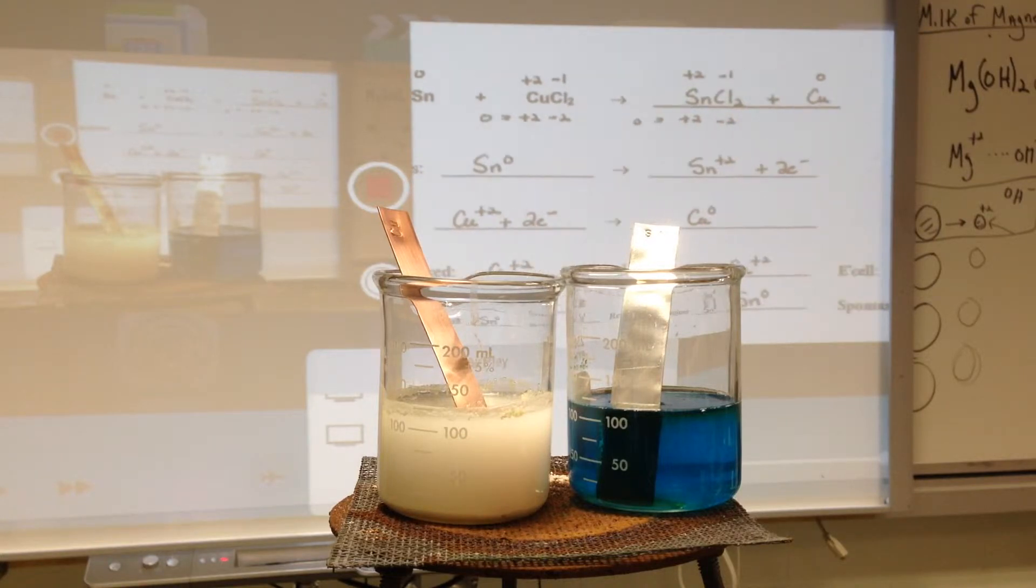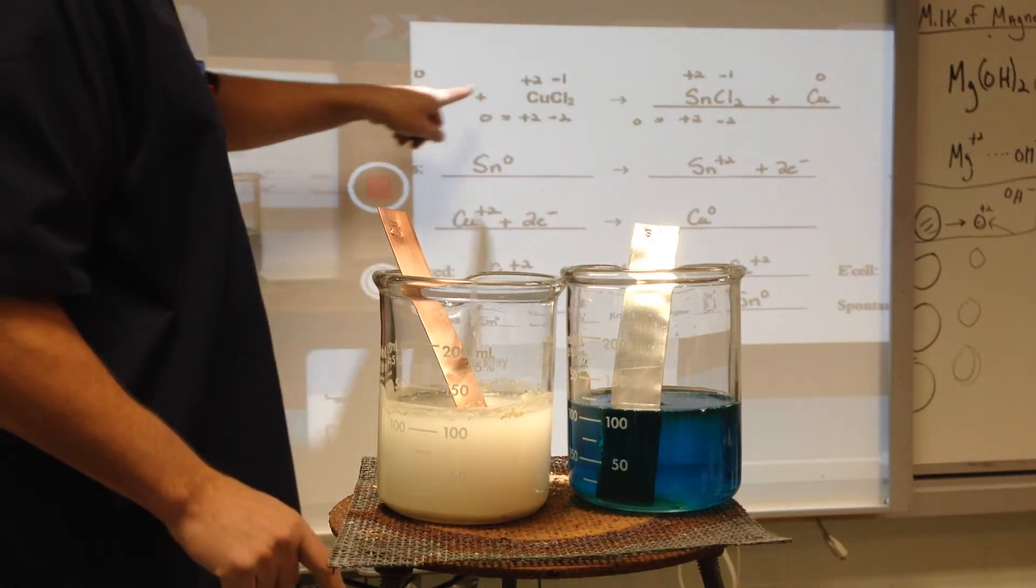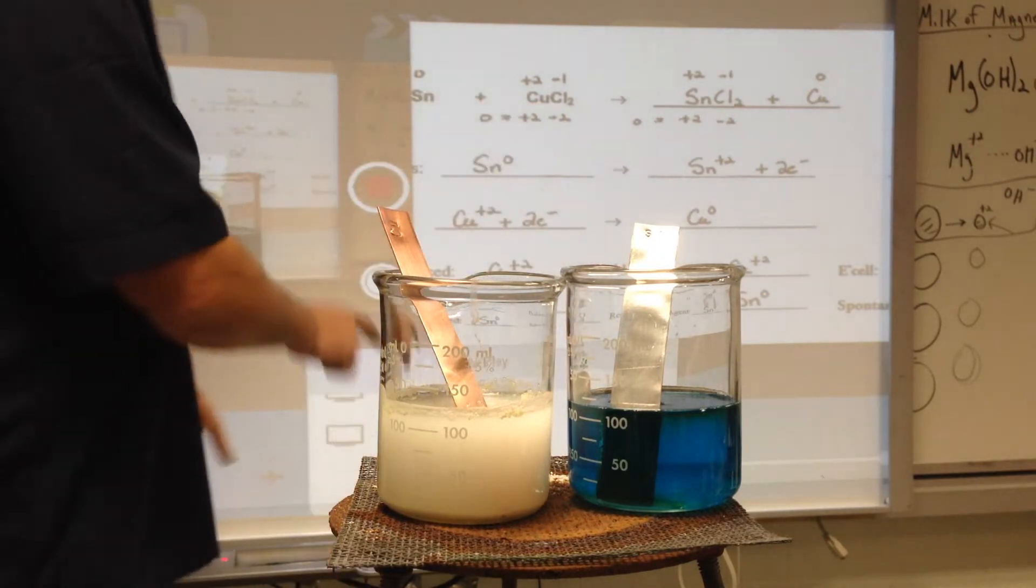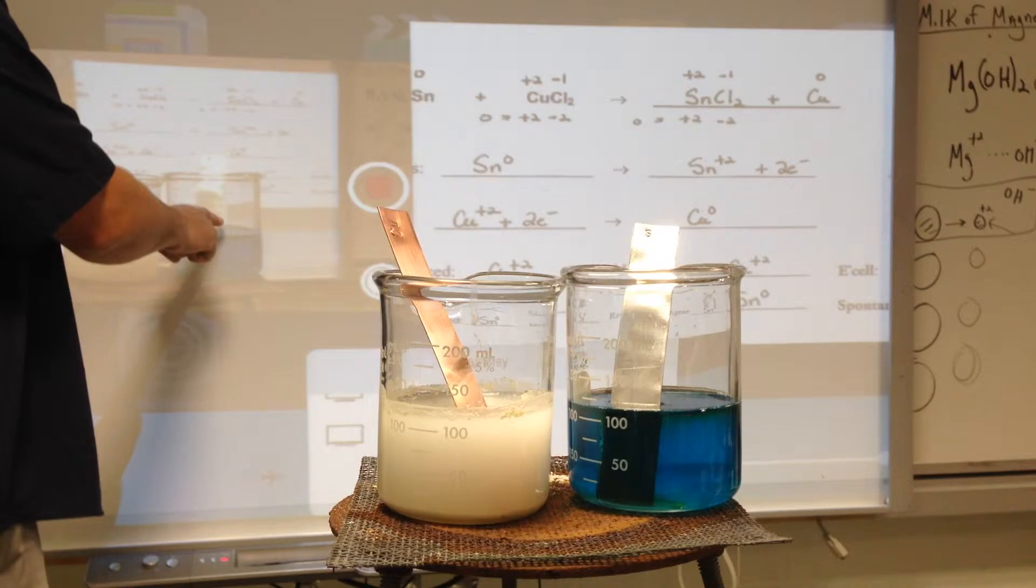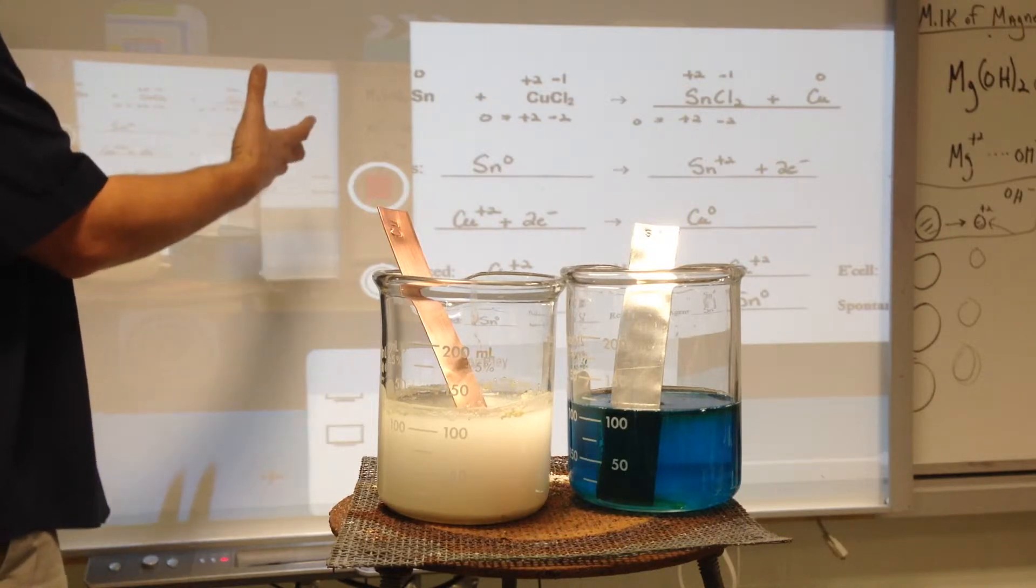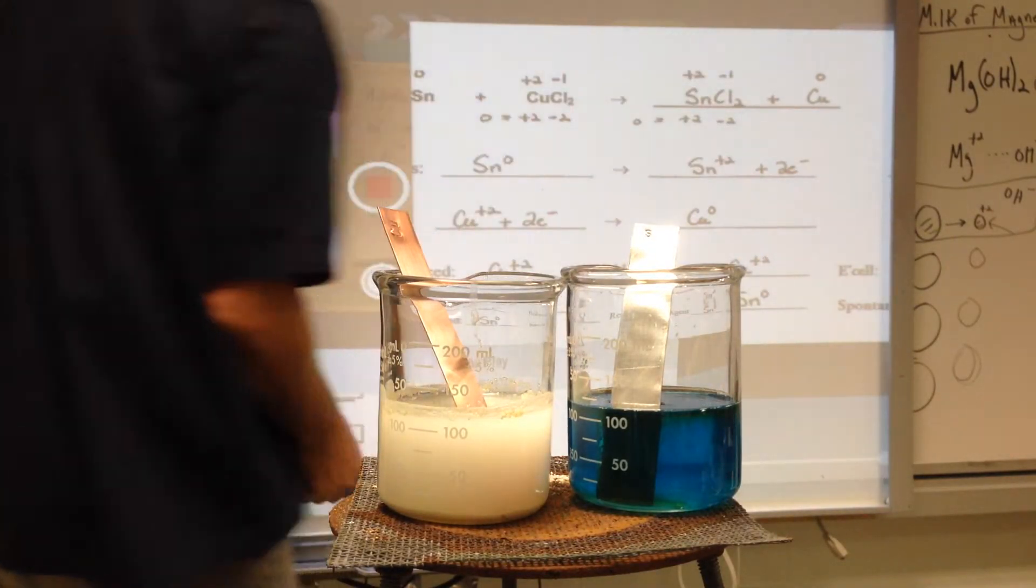In this reaction, I have pure tin sitting in a copper plus two solution. That's what's happening right here. What's going to happen is, if it's spontaneous, we should be having pure copper being made.